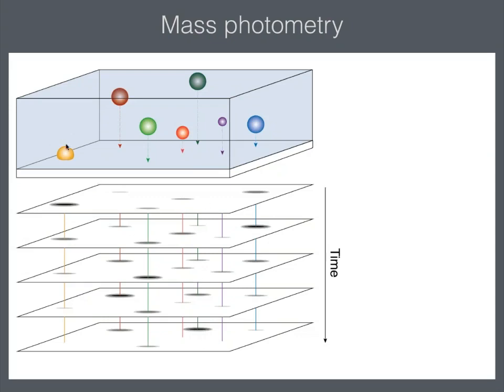Whereas the one that already gave you significant signal in the first frame, because that no longer changes, its signal starts to decay, and in the 5th frame you no longer see it. So we get a time-resolved measurement of molecules as they approach and contact the detection surface, which is the cover slide onto which the droplet has been put.